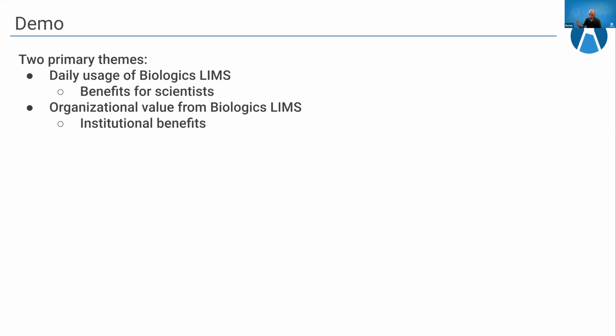I'm next going to jump into a little bit of a live demo. Now, I can't show it all. I'm going to keep it fairly high level, but I really want to push on two primary themes. The first one is benefits for scientists from daily usage of our Biologics LIMS.